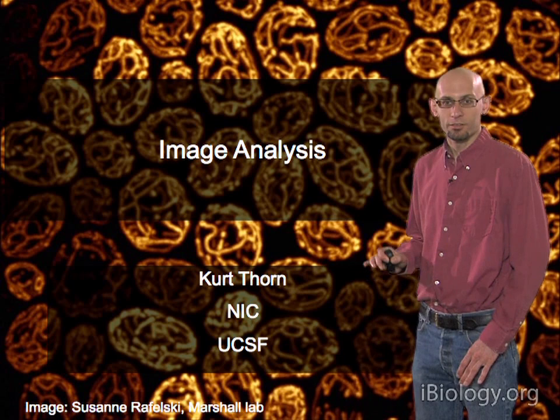Another very common one is edge detection. You can sort of see what we're doing here if you just look at these filters. There are two different filters here, one on the top and one on the bottom. They do essentially the same thing. They take the difference between one row, this top row here, and the row two away from it. If there's a bright thing in this row and a dim thing in this row, we'll get a bright output. But if these two are about the same, you'll get a zero output.